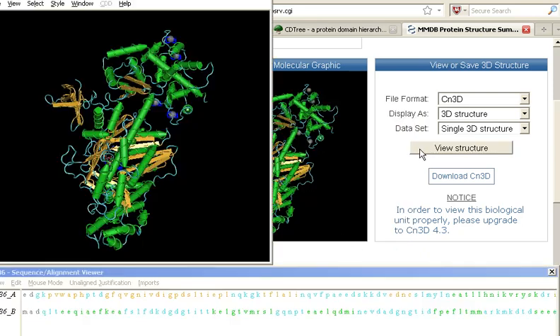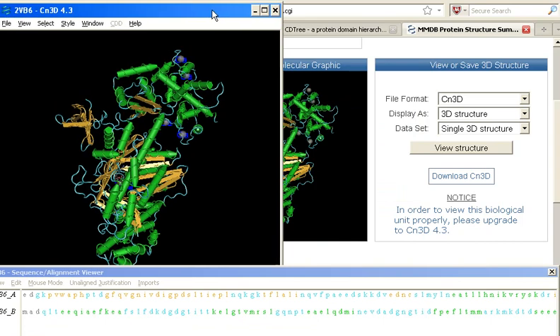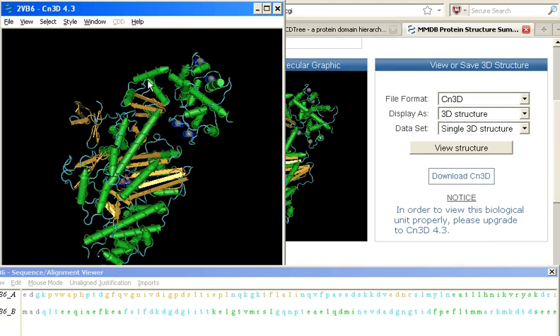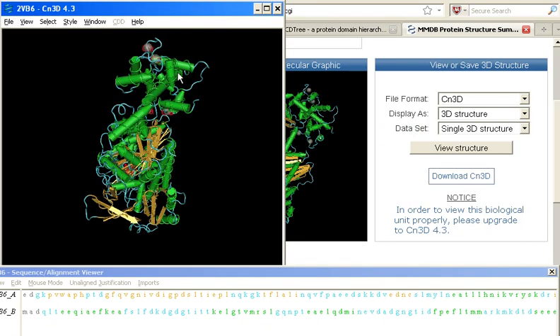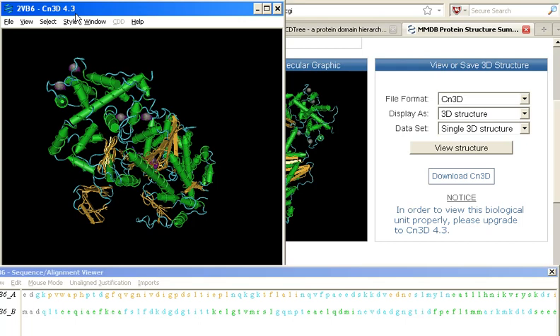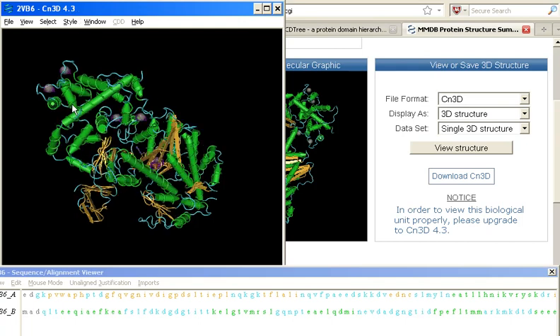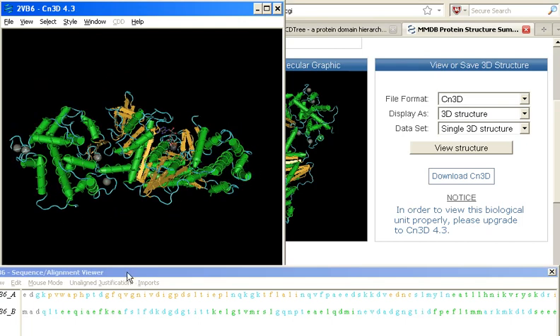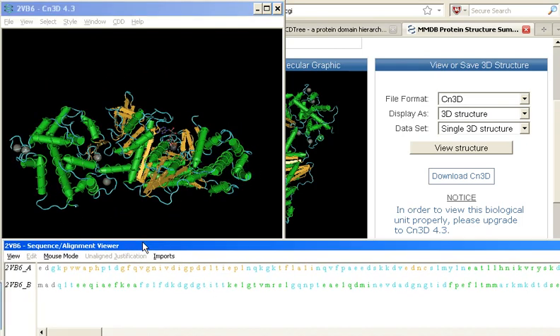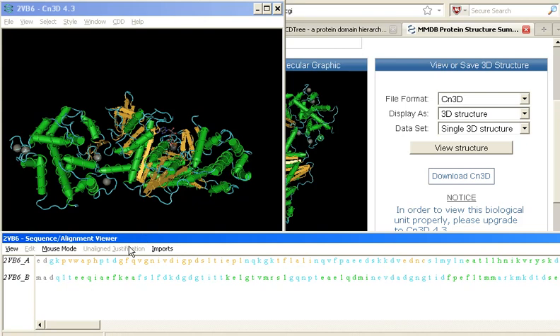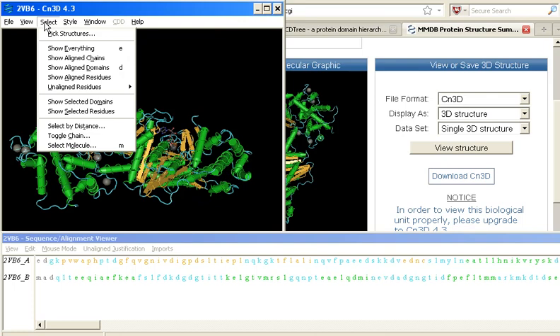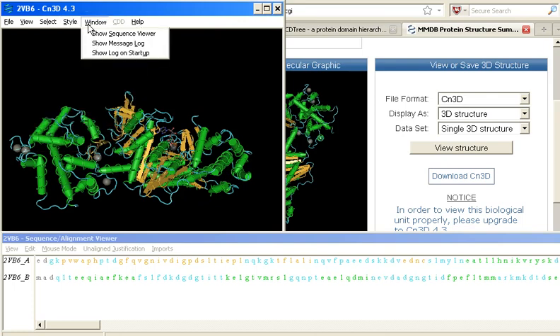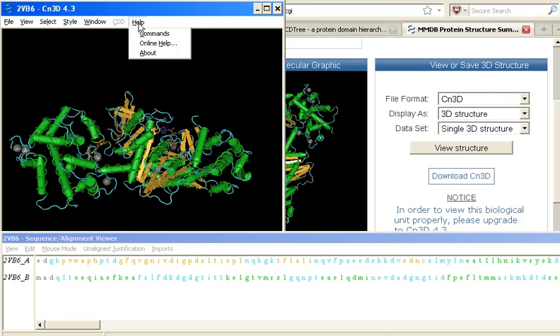When I click that link, the software opens, and you can see that I have one panel that is the 4.3 interactive 3D viewer, and a second panel that is a sequence alignment viewer. There are a variety of different options for things that I can select, styles that I can view, windows, etc. There is a help that explains these. I don't have time to go into them in this tip. Please check them out either in our tutorial or on your own.